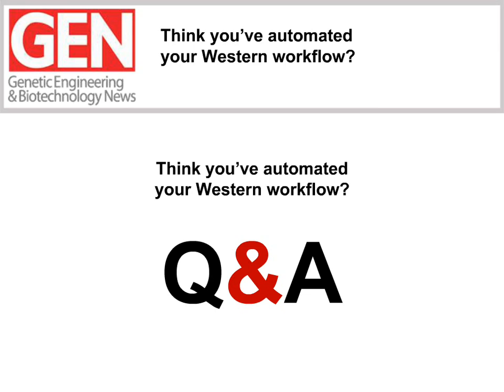All of our notebooks that we generate in Mathematica are also Git tracked. Just like you may sign your paper notebook at the end of the day, we just submit our notebooks to the Git tracking system, and this allows for our records of all previous history of those notebooks.